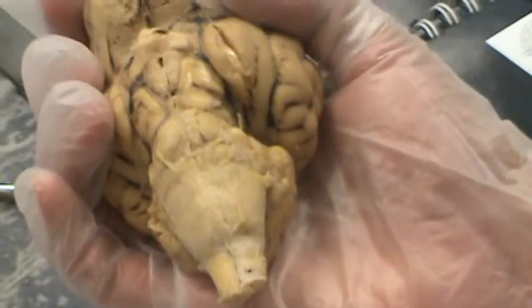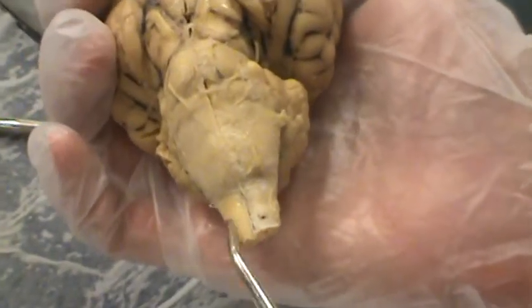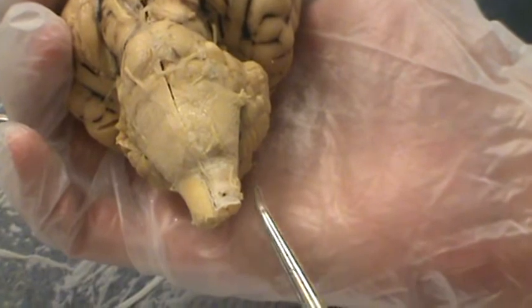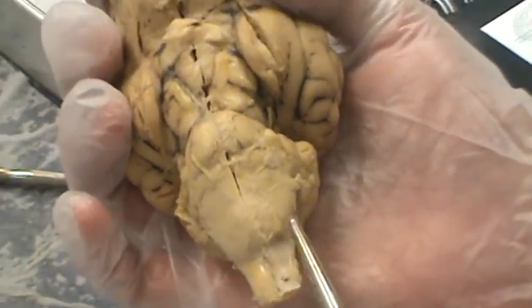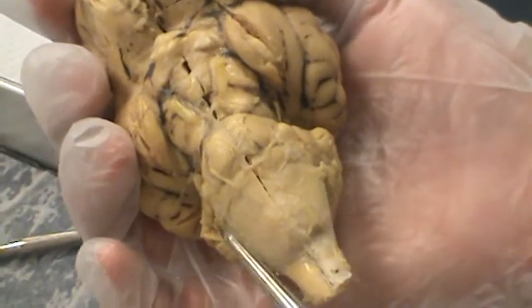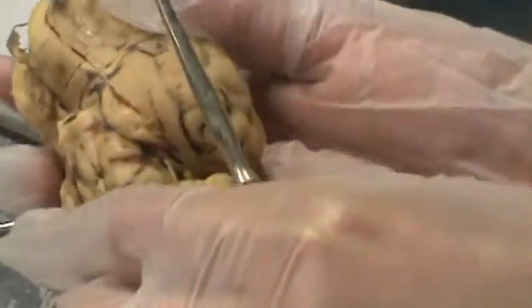And then onto the brainstem. This is the brainstem. And this is also called the medulla oblongata. This is the pons, which is above the medulla oblongata. Pons. The midbrain is right here.